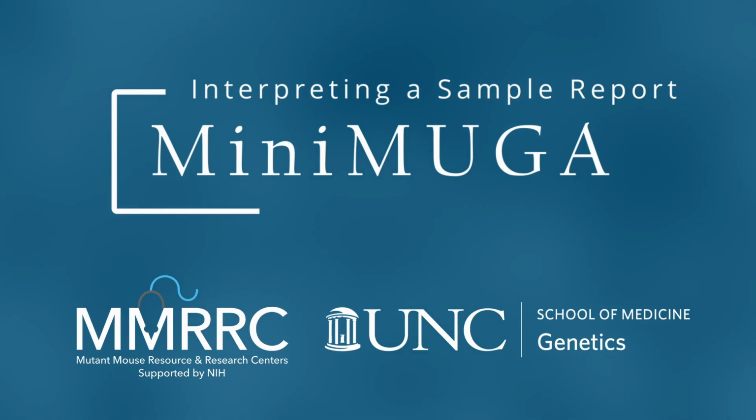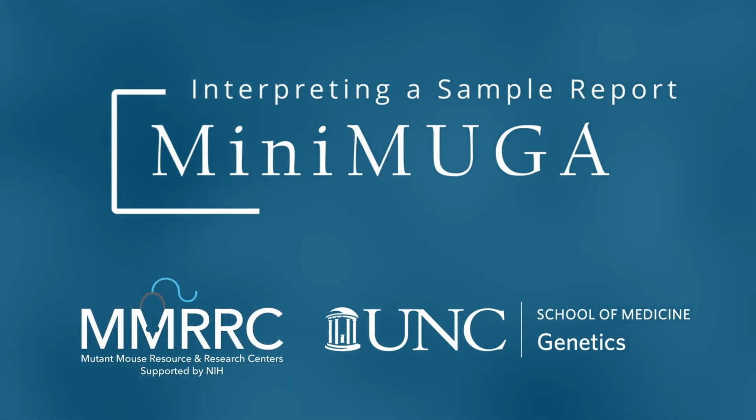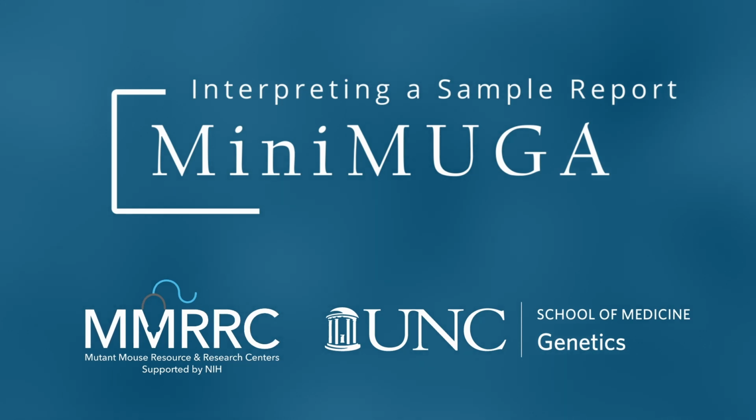This video is part of the MMRRC at UNC's efforts to provide community-oriented tools to optimize the use of mouse models for biomedical research. We will use examples of the MiniMUGA Sample Report to illustrate how to interpret the information it provides.